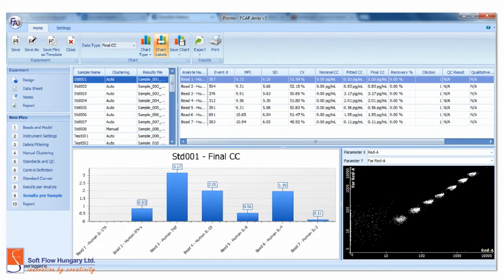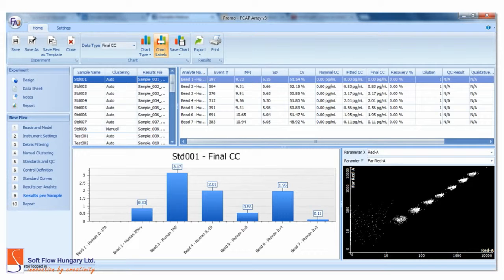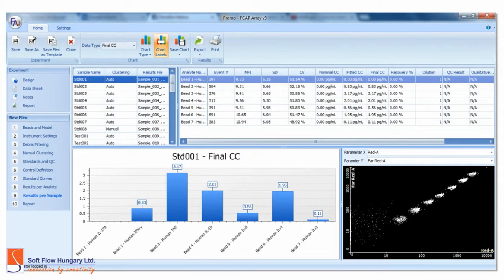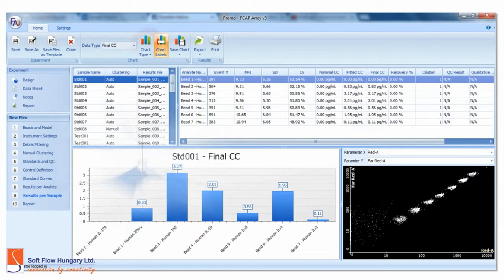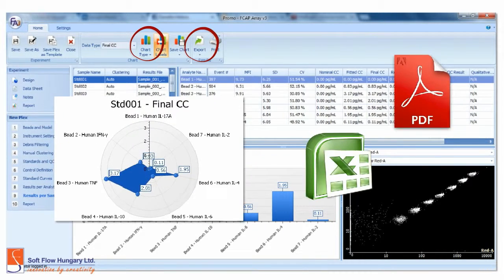And this is the screen for results per sample. Observe that association is different. Now all the data are shown from sample results perspective. For both sessions, you can also change the chart type and export in different formats.